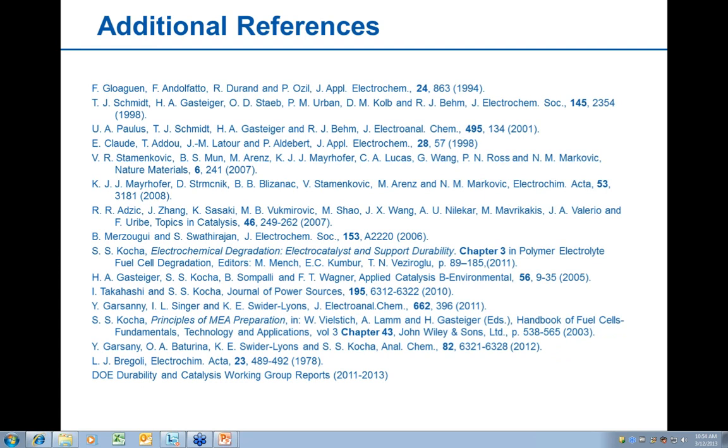So is there a limited amount of catalyst that can be put on the rotating disc electrode in the absence of a binder? No, actually, as you saw in the slide with the effective loading from 0 to 80 micrograms per centimeter squared, you can use any amount of catalyst that you want. But as you saw in the plot, as the film gets thicker, obviously you have more oxygen transport issues. So I would stick generally to 18 micrograms per centimeter squared or lower for inks with and without Nafion. Okay.